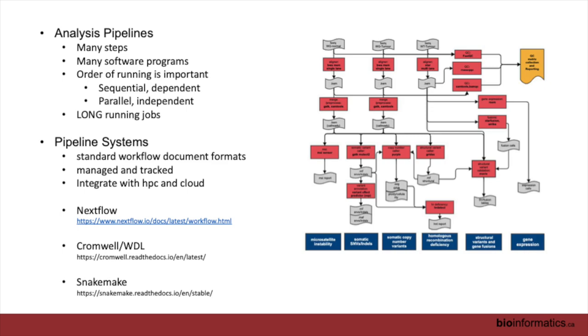And these are, making the point here, very long running jobs sometimes when you're working with 80x, 30x whole genome. It could take days to get through the processing. A lot of our effort in terms of pipeline development is trying to find ways to optimize it, improve it, make it go faster. We have a big emphasis right now on trying to reduce the overall turnaround time for our clinical reporting. And there's a lot of effort going on with our pipelines to reduce as much as possible how long it takes to process.